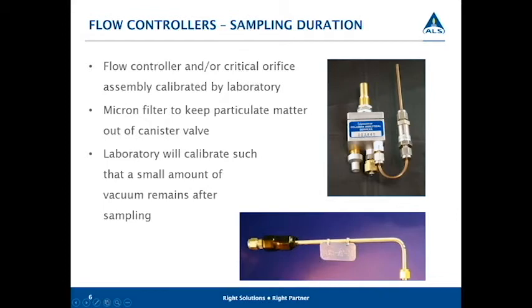Flow controllers and sampling duration. So the flow controller, or maybe called a critical orifice assembly, is a device calibrated by the laboratory. And these have micron filters to keep particulate matter out of the canister valve.